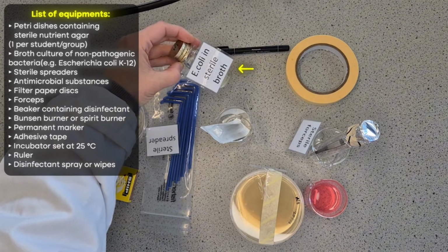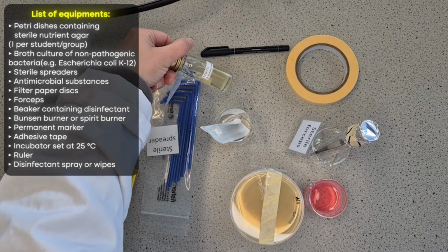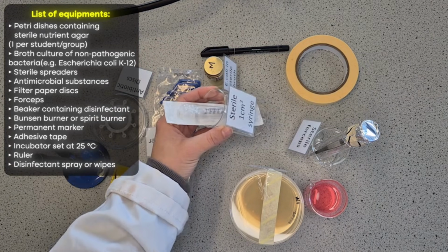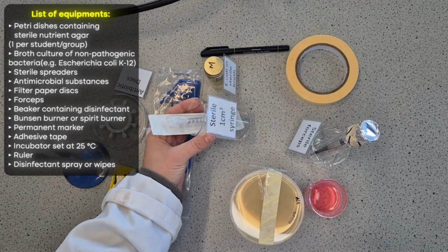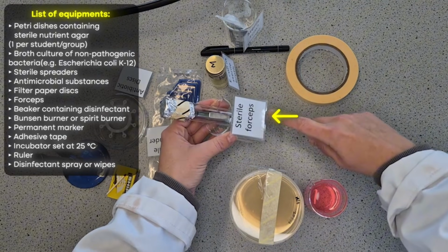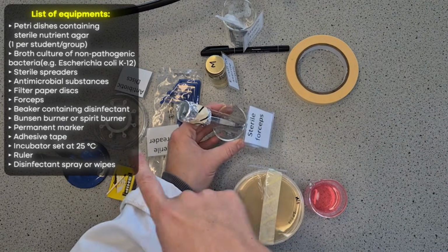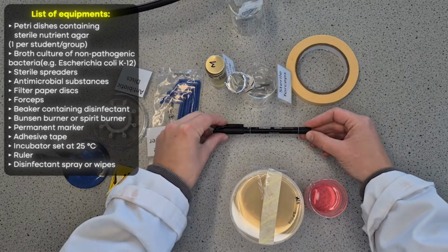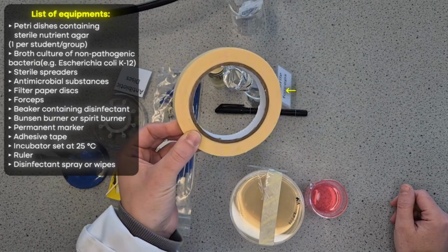coli bacteria, which we can see here, the strain K12, which is a safe strain to use in schools. I also have a sterile syringe to use to transfer the bacteria onto my plates. I've got my pre-sterilized forceps to move the antibiotic disc onto the plates. Permanent marker to label the Petri dishes, tape to tape down the lid of the Petri dishes.